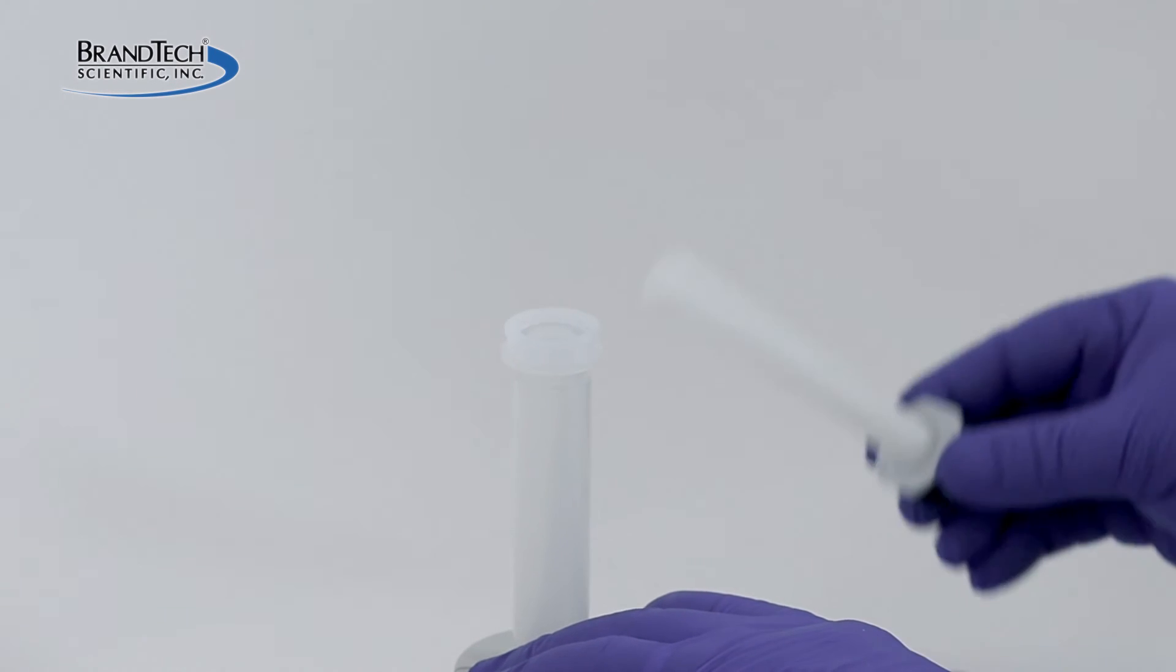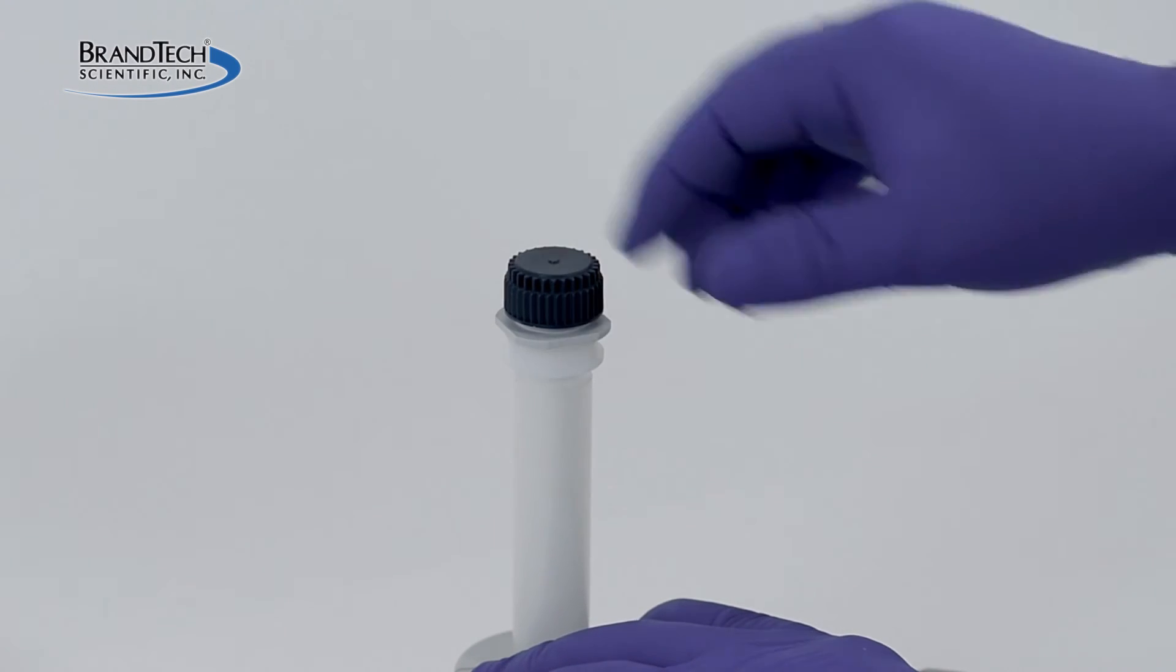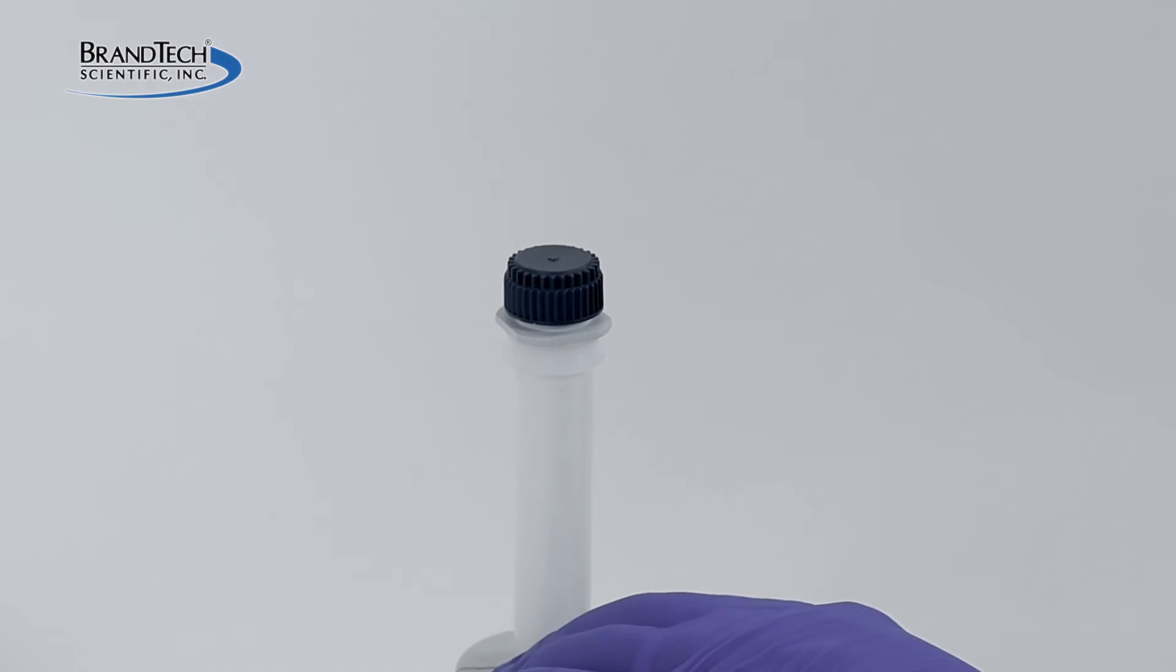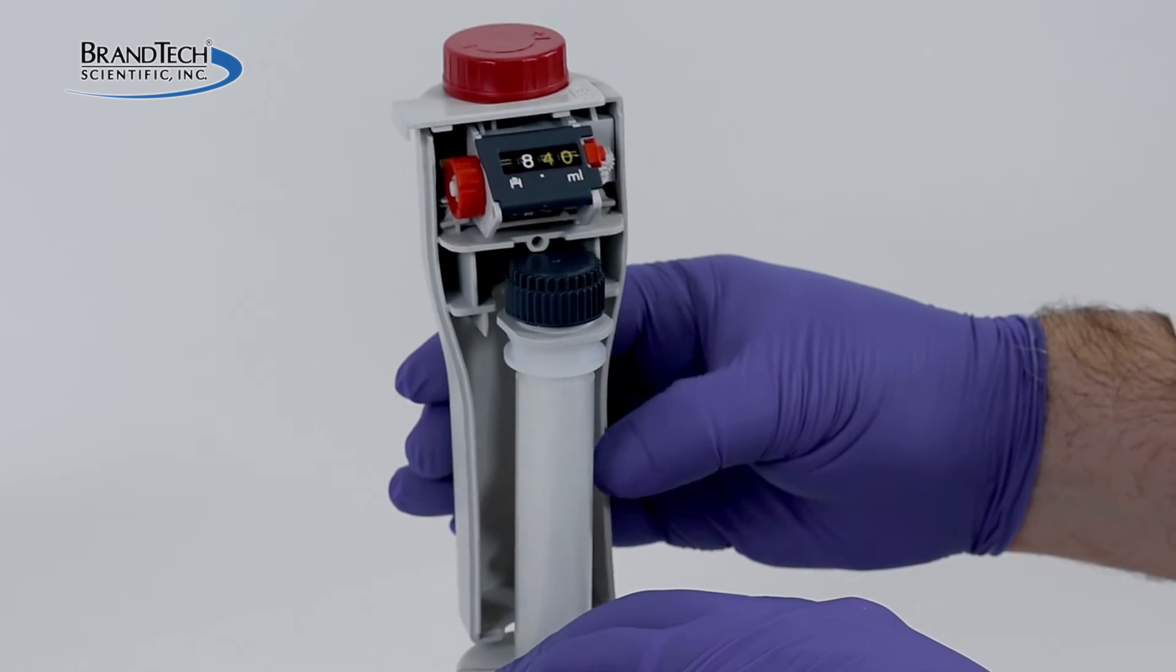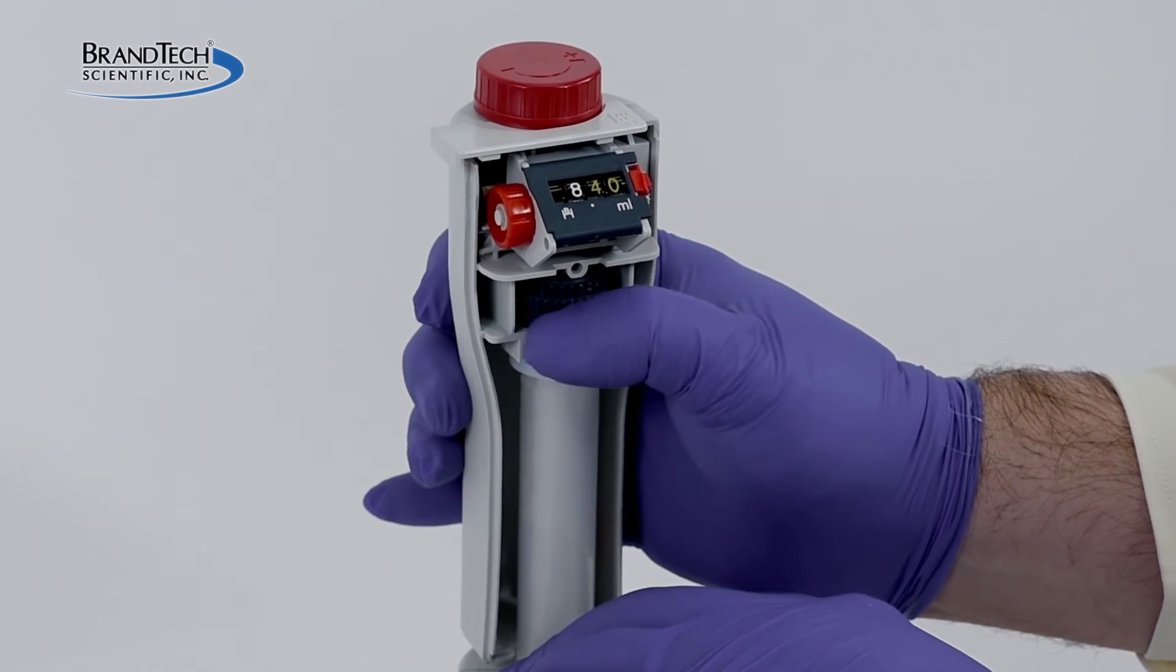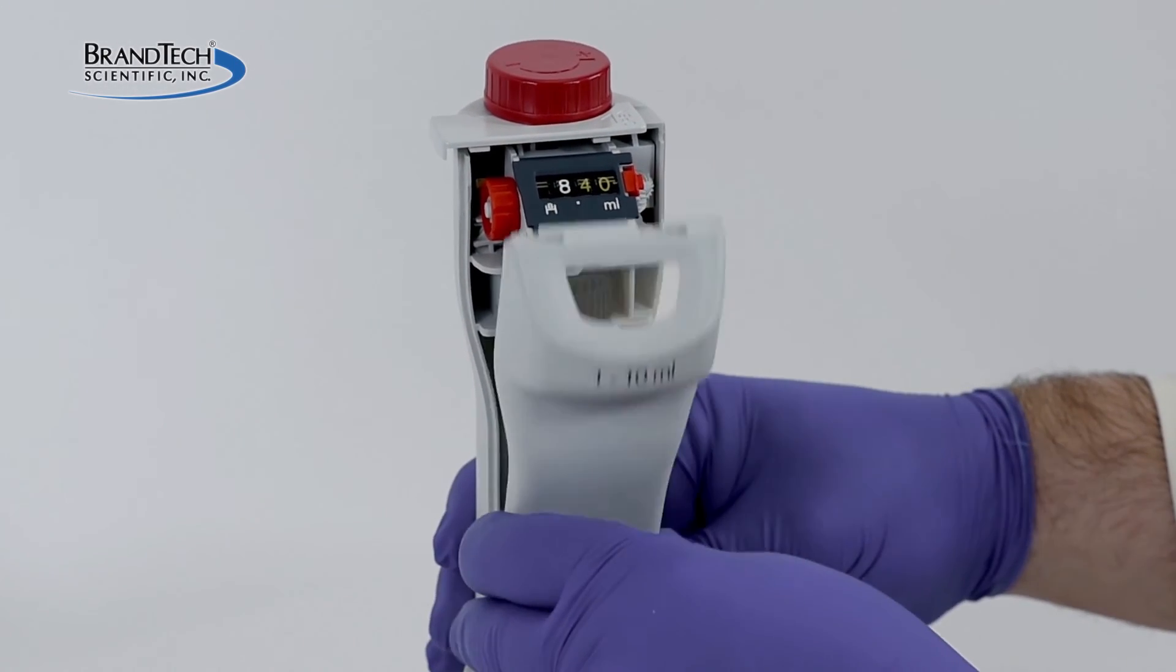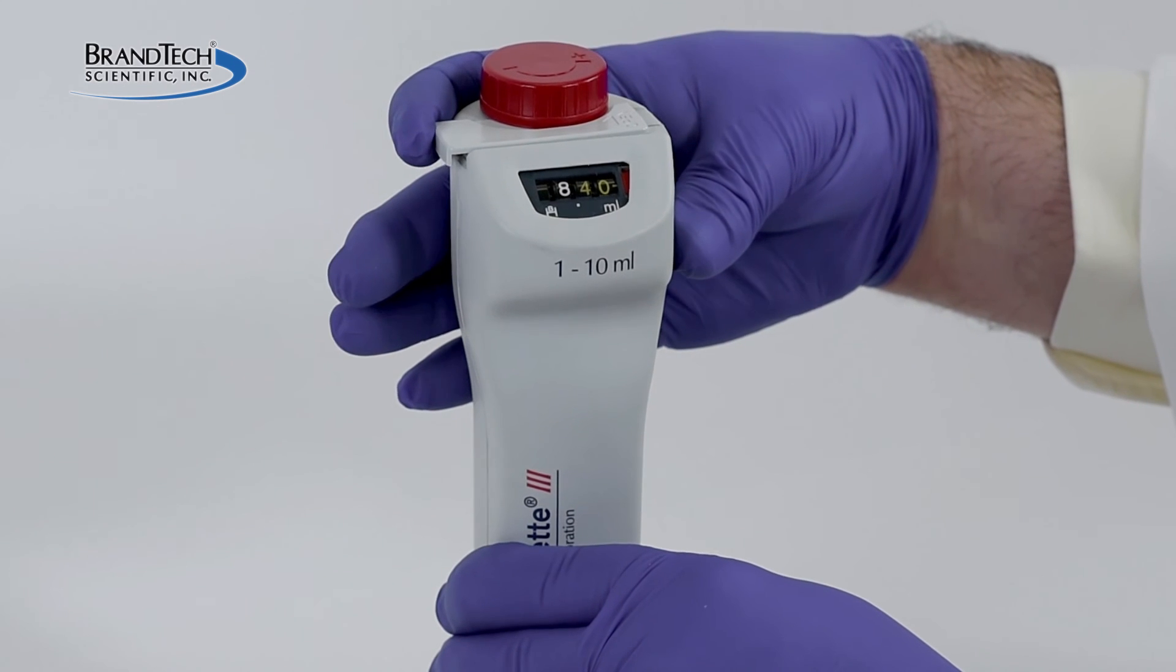For a digital easy calibration model, insert the piston into the cylinder. Replace the rear housing and tighten the cap with your fingers. Use of the valve tool is not necessary. Replace the front of the housing and slide the tab to secure.